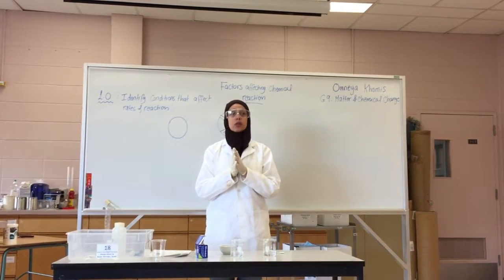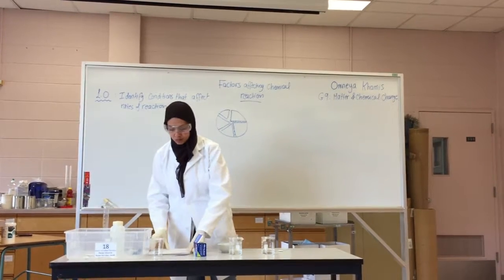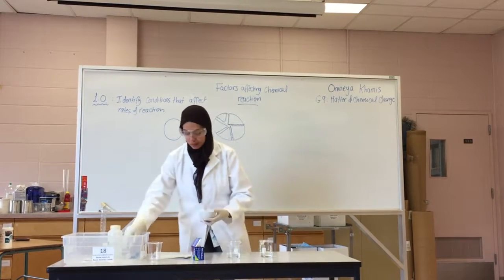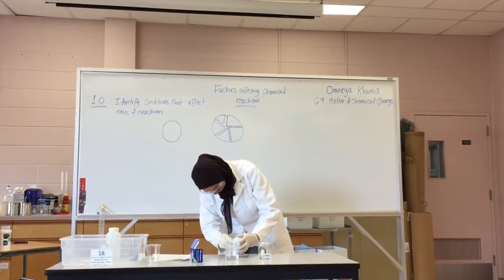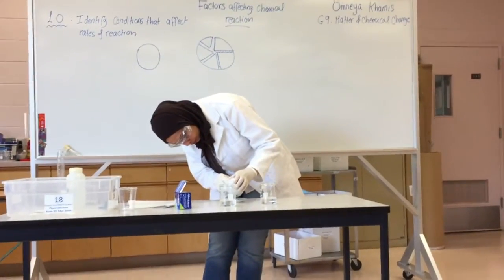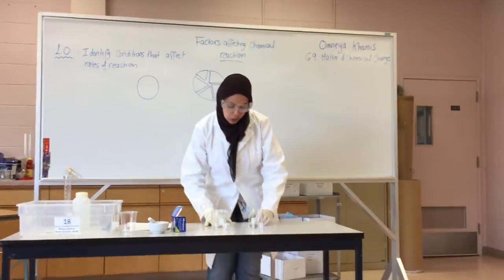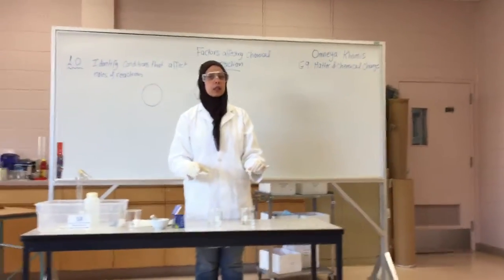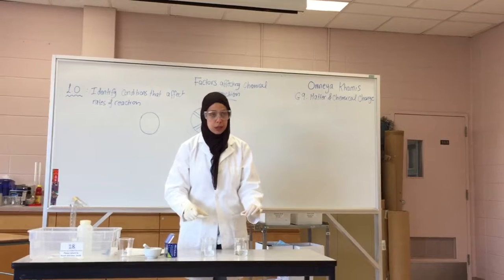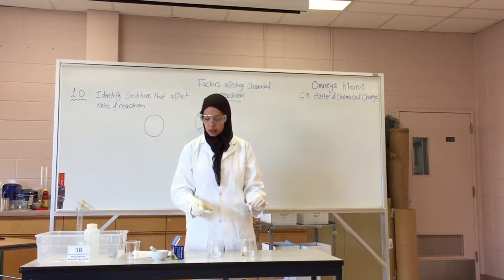Okay, so now I need 2 volunteers with a stopwatch. What I'm going to do now, I will place both tablets on top of water, and I will ask the 2 volunteers, once I put the 2 forms of tablet in water, to record the time till the reaction stops. Before doing that, I want to ask you a question.